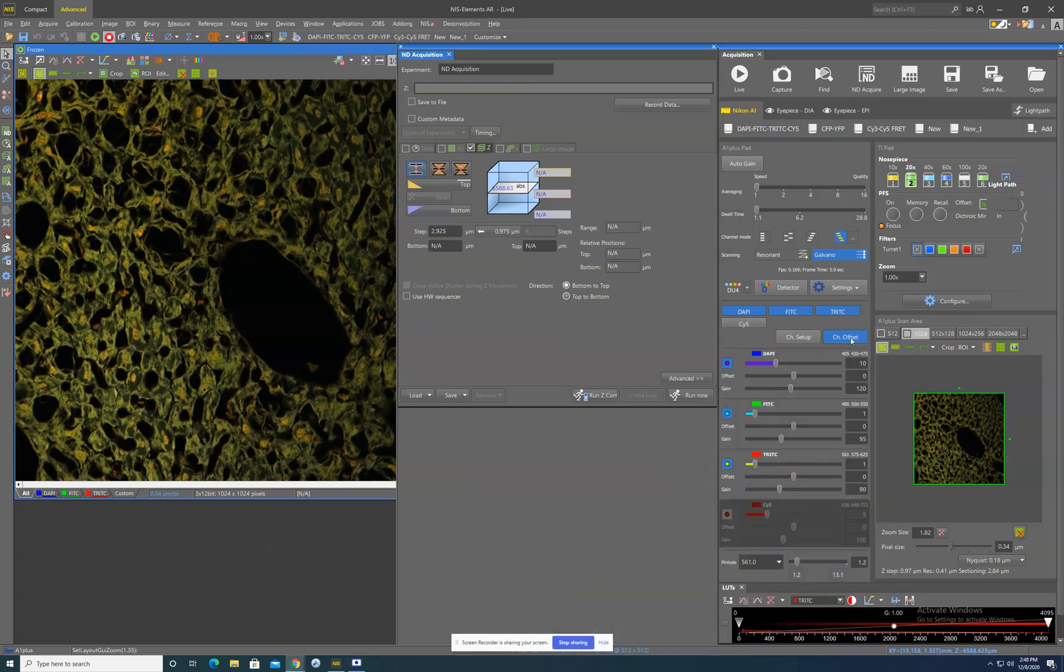Okay, hello. Excuse the giant Nikon Elements screen. I want to make sure everything is nice and visible.